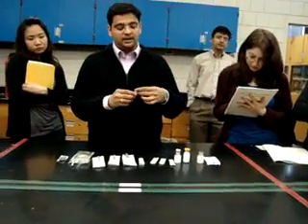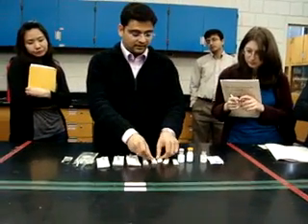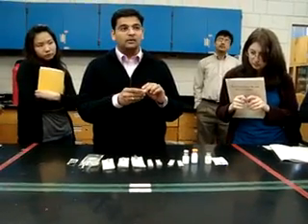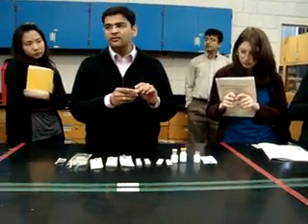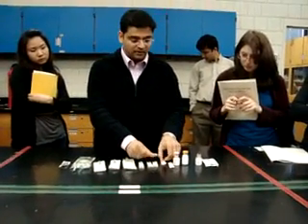The procedure that we are teaching you today is exactly what the state board wants. The ones that you might have done at your job or somewhere else may be a little different, but this is exactly what the state board wants and how the state board wants you to work.